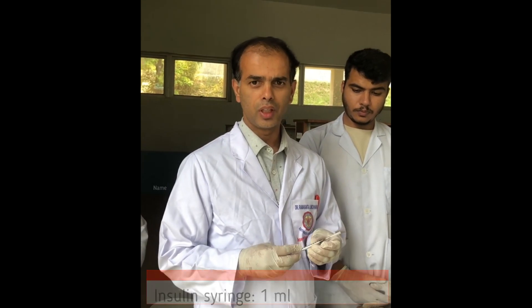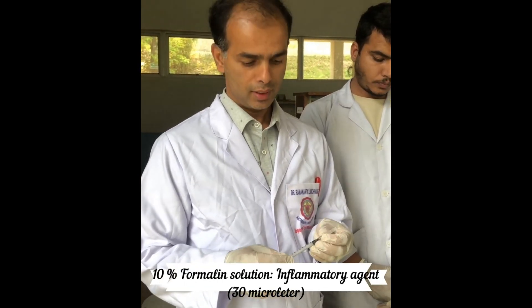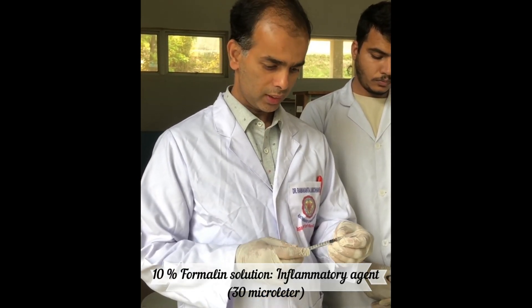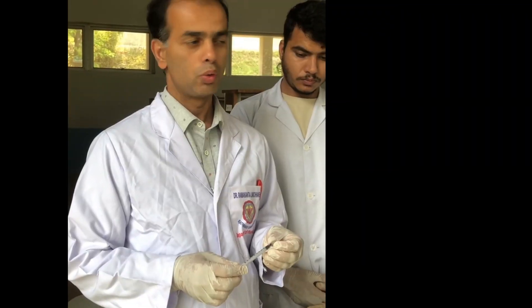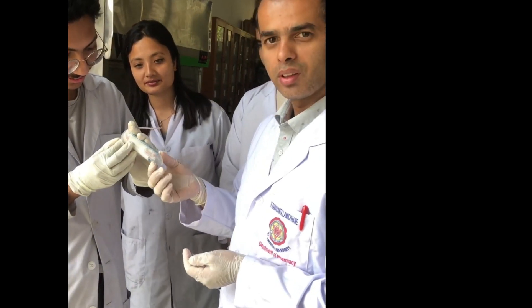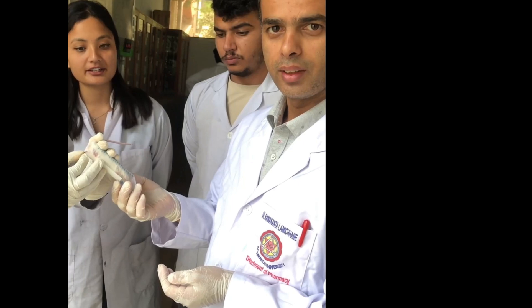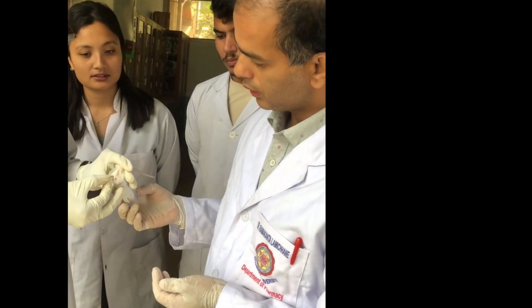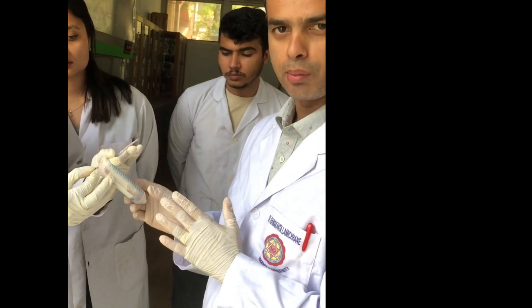We are going to inject 0.03 ml — that is around 30 microliters — of 10% formalin, which is an inflammation-inducing agent. We are going to inject it into the paw of the mice. To start the experiment, we have to hold the mice properly so that we can inject the inflammatory agent comfortably.